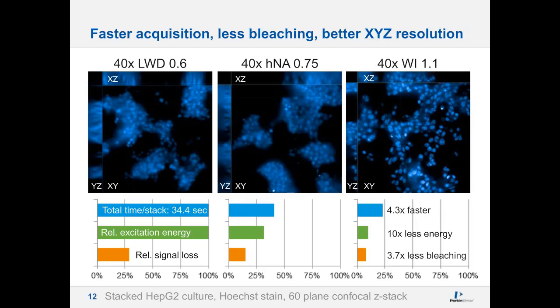reduced to minimum. Now you might say this is just a Hoechst image and might be a rather boring example of that, but bleaching of Hoechst is a really good proxy to understand what excitation power might do to your live cell samples. The less bleaching you have in an experiment like this, the better live cells will tolerate long-term extended time-lapse imaging. So managing excitation light is a key consideration when planning for long-term live cell experiments. So this should give you an idea how much water immersion objectives can speed up your research and can improve your research results.